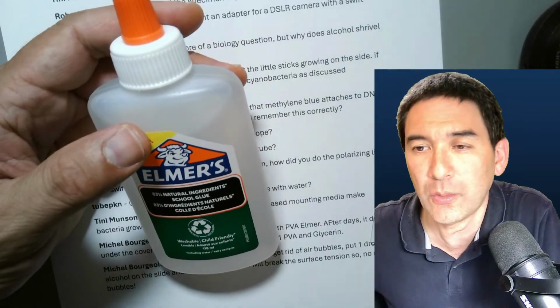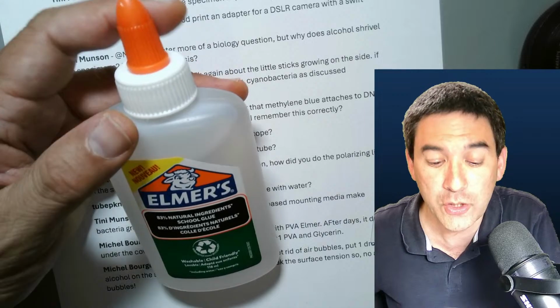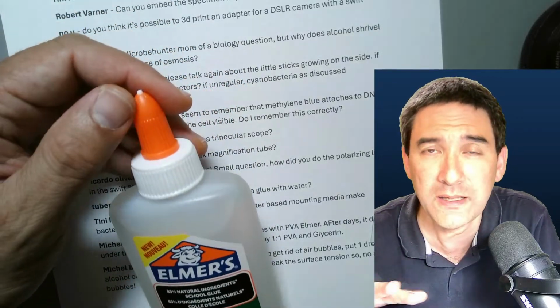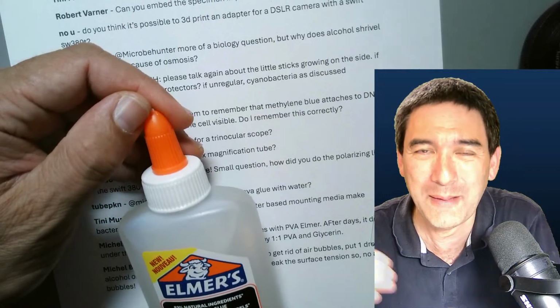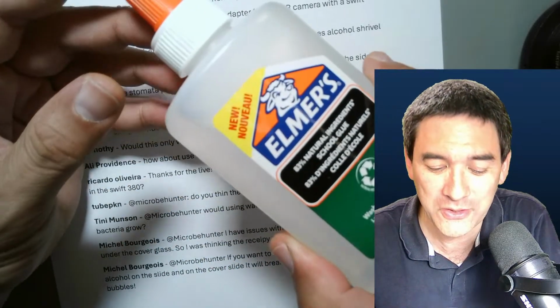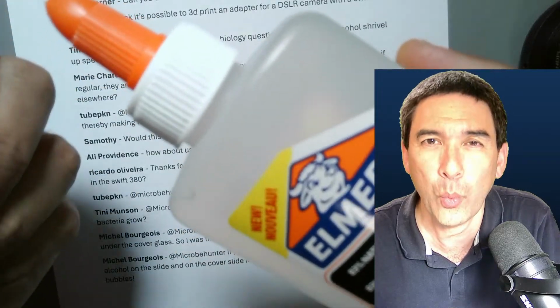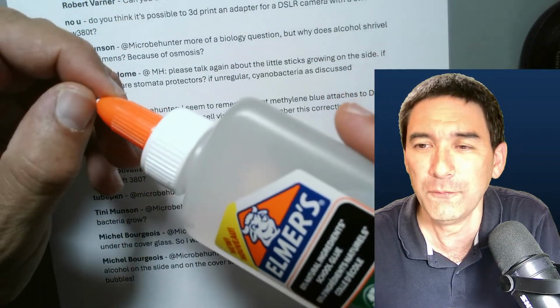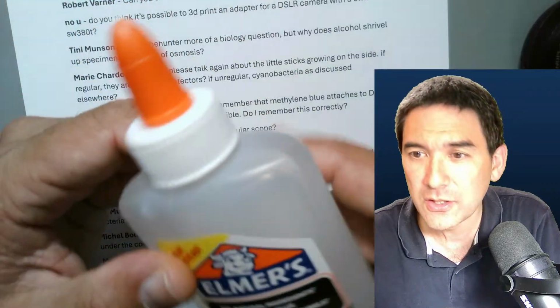I think I understand now what you mean. Yeah. That it starts to disappear, and then you have actually bubbles forming. You see, you have to kind of find a little bit the optimum spot. Not too much water added and not too little. But I found out that the glue, as it comes out of the bottle, is also very thick. It doesn't flow well, right? And it also becomes more difficult to actually remove the air bubbles. Okay, yeah.